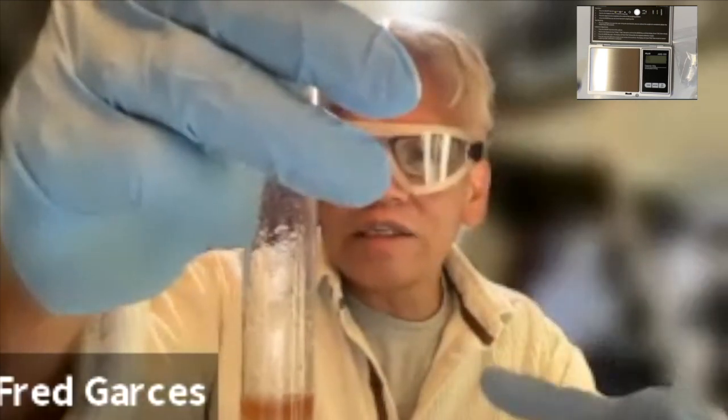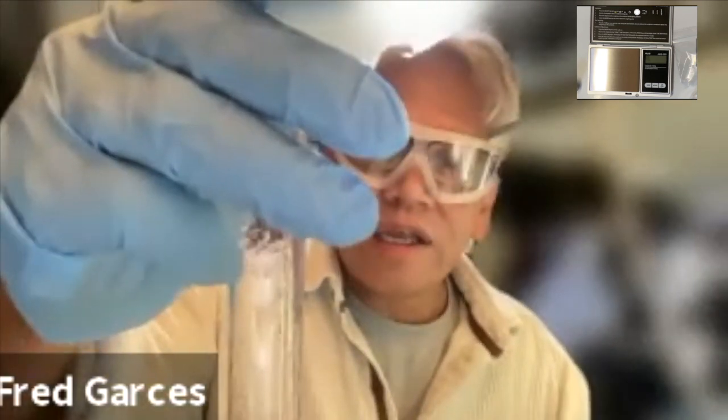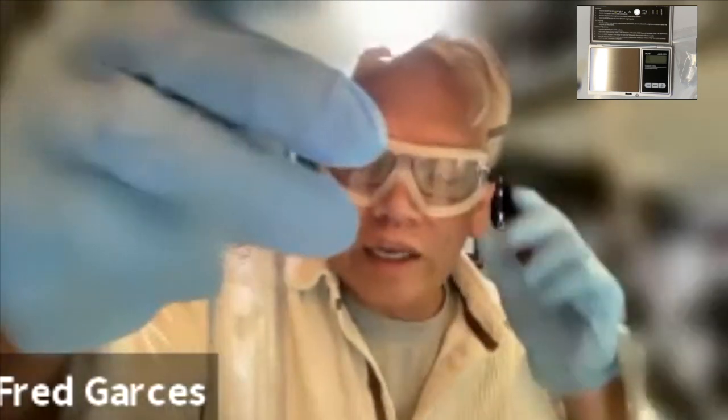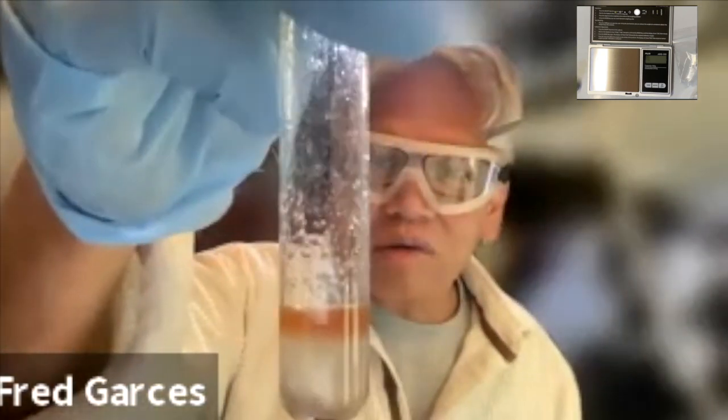It looks like 3 milliliters. That must be liquid A. This layer is the smallest. That looks like 1 milliliter. Looks like liquid C.